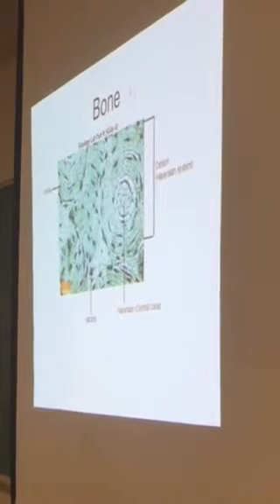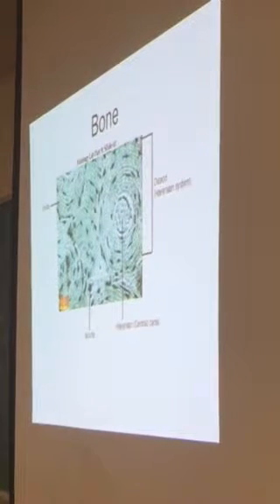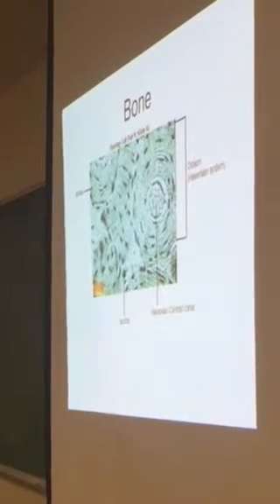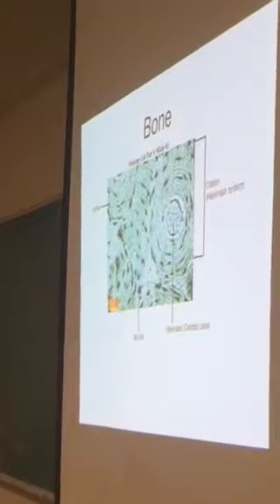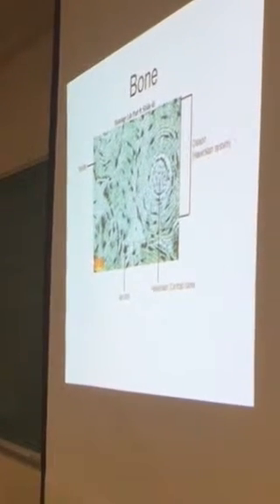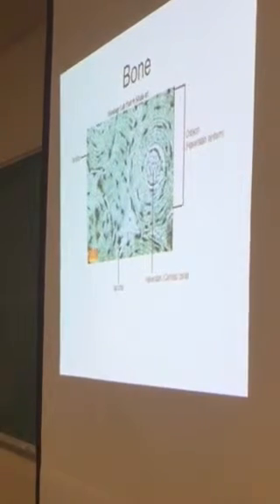The little lines extending from the lacuna, where the osteocytes would be, are called canaliculi. They are moving towards the Haversian canal because that is where the blood vessel is. That is where the nutrition is coming from. So those little lines contain extensions of the osteocytes. But the canal, the space itself, is a canaliculi.